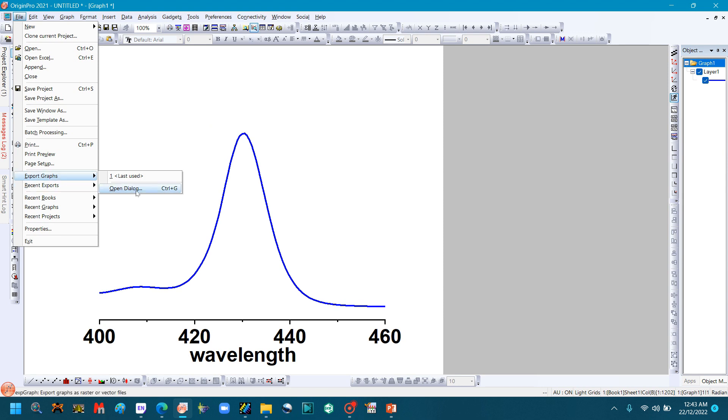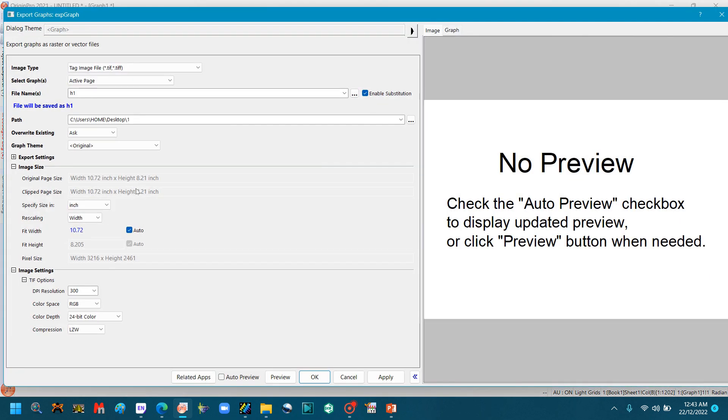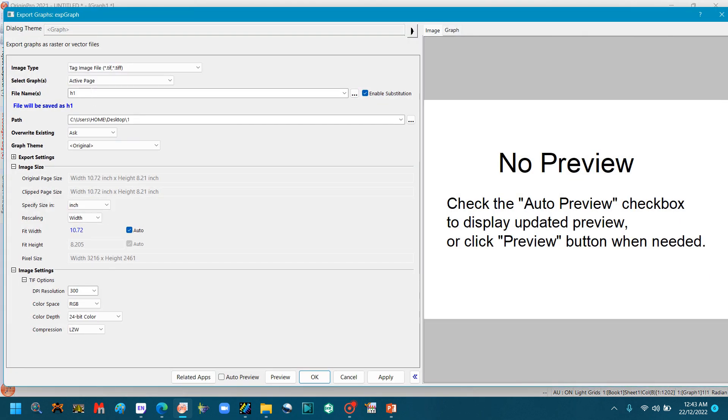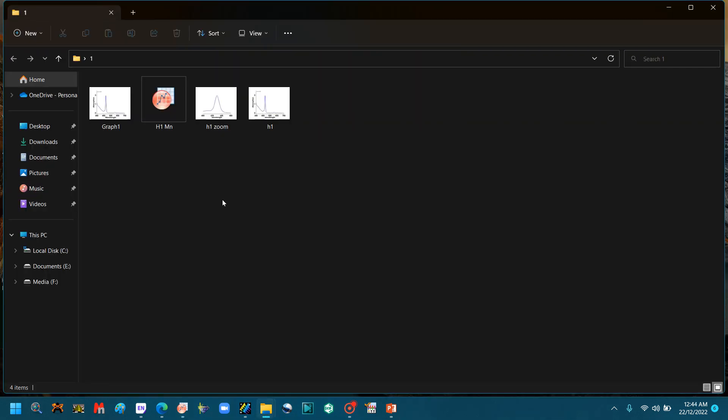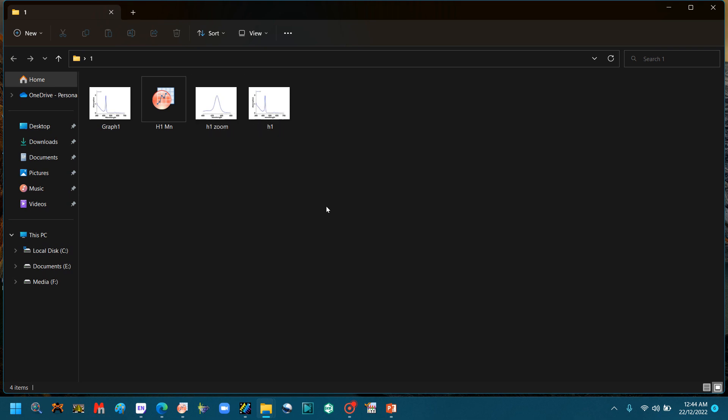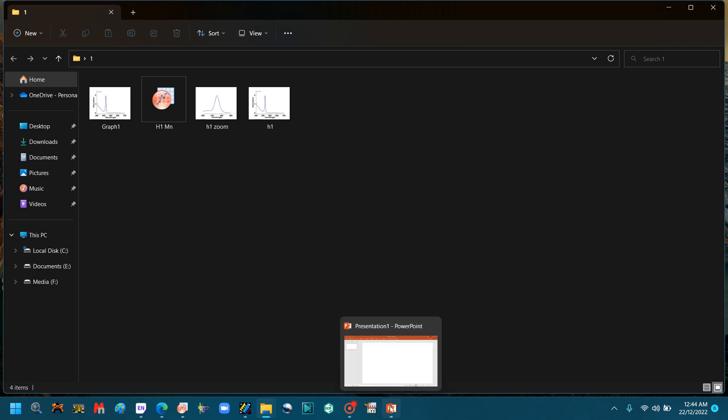Now you want this portion only, so again go to File, make its TIFF file. Go to Export, open the dialog, image type TIFF file, name H1. You can also change its name. Select the path and click OK. So we can see we have both zoom file and original file. Now open PowerPoint.